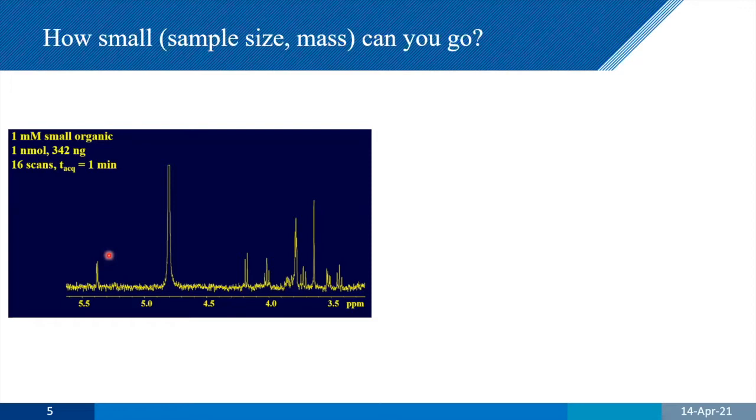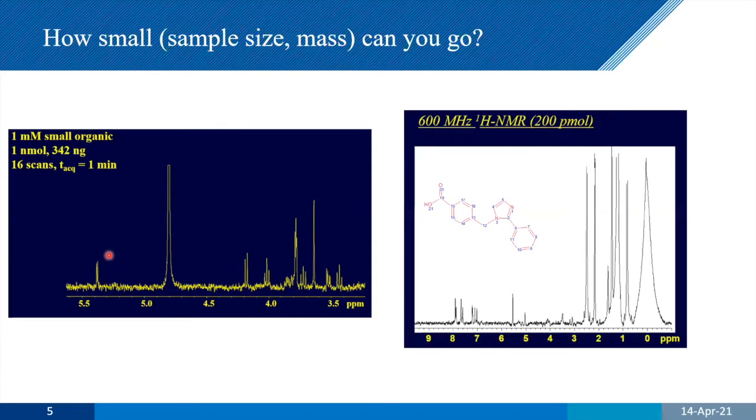And let's take it further and look at, well, why would we want to do this from a practical point of view? We can take it from nanomole down to picomole. And this is some spectra that were taken from a combinatorial chemistry experiment where you basically synthesize tens of thousands of compounds in very, very small amounts, and you want to get the NMR spectra. You can't do that if it's going to take forever. And so here we are down at the picomolar level. And this is new areas for MR. We haven't been able to see this.